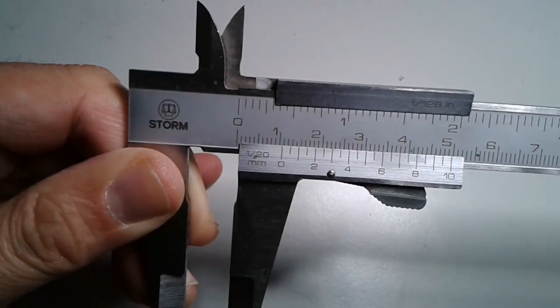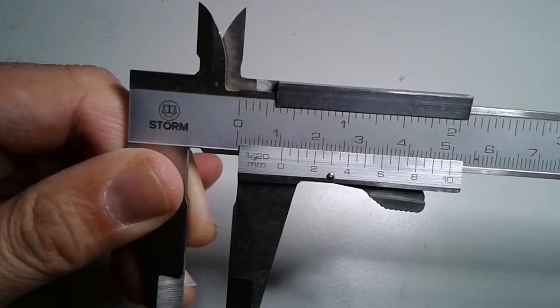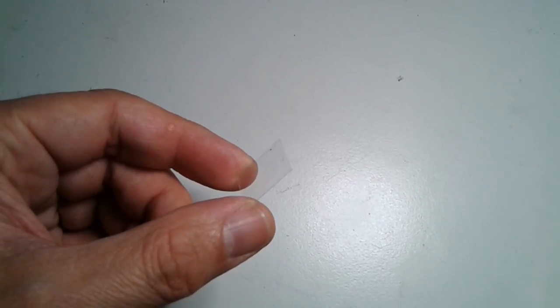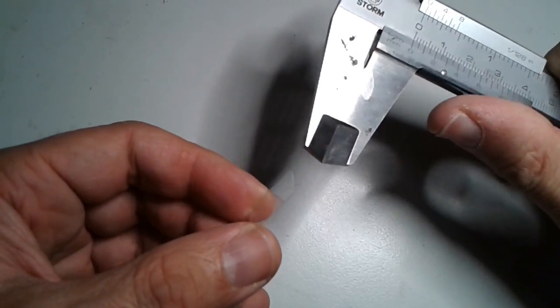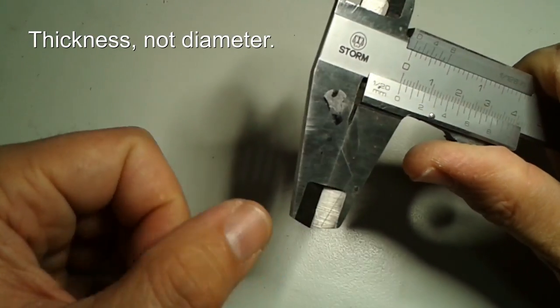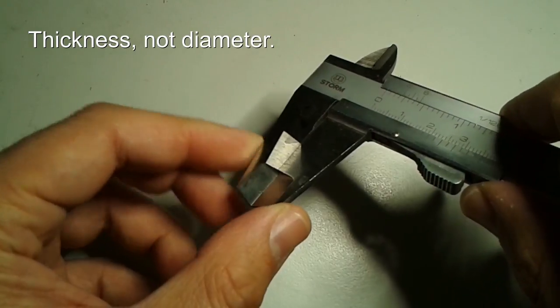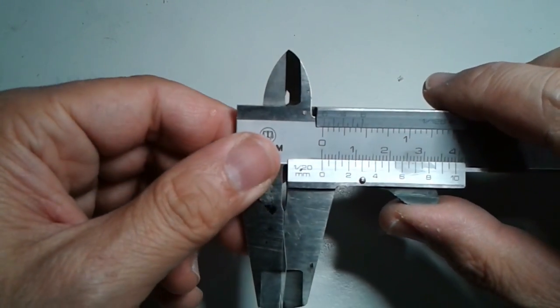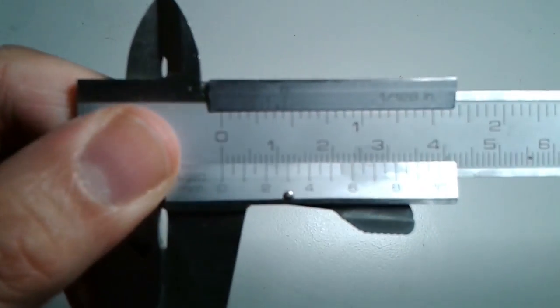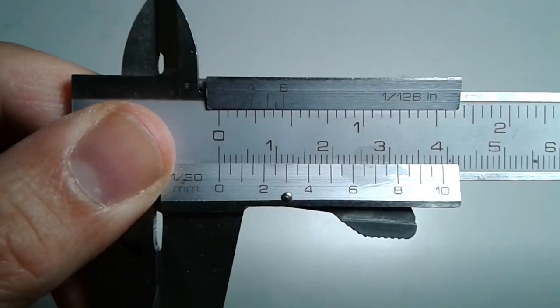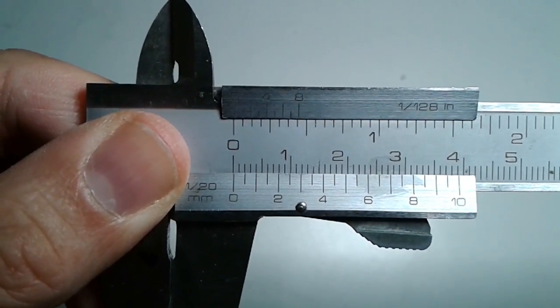That is now one cover glass and what you can easily do is you simply can measure the diameter of one cover glass. It should be around 0.15 millimeters. That is these are the standard cover glasses. Actually on the microscope objective it says 0.17 millimeters that it should be, but this is because sometimes the specimen is a little bit further down into the mounting medium so you give 0.02 millimeters of tolerance here.